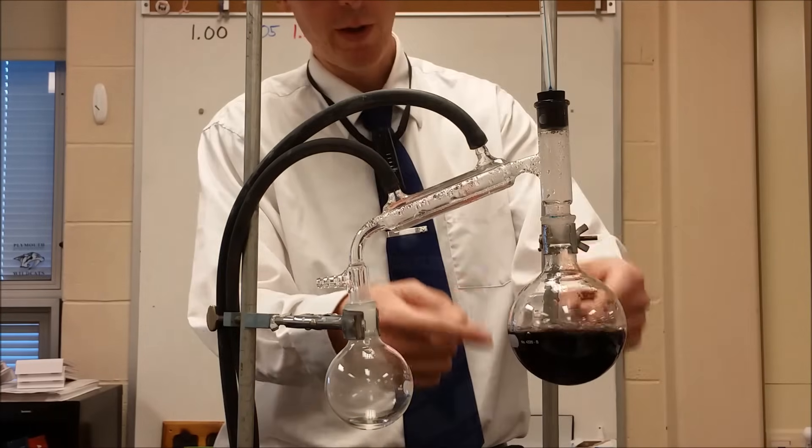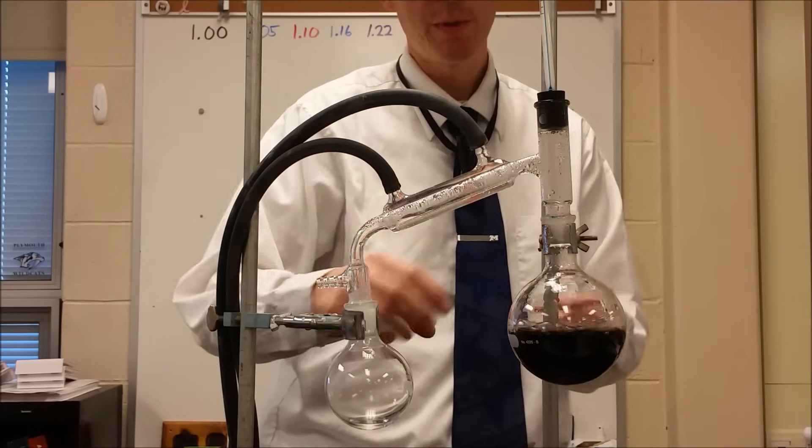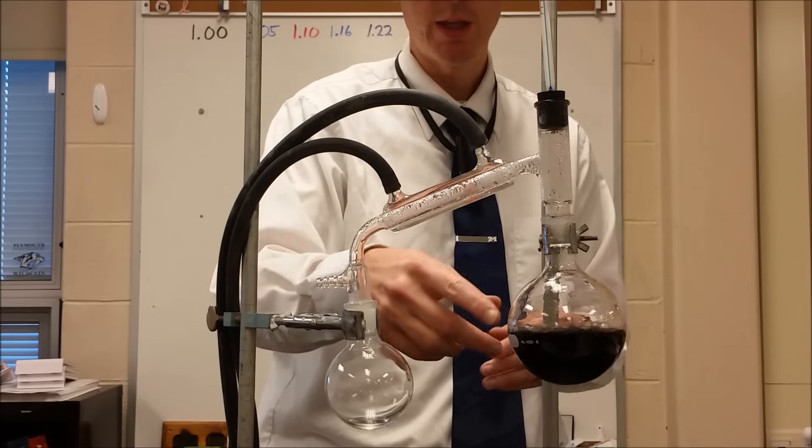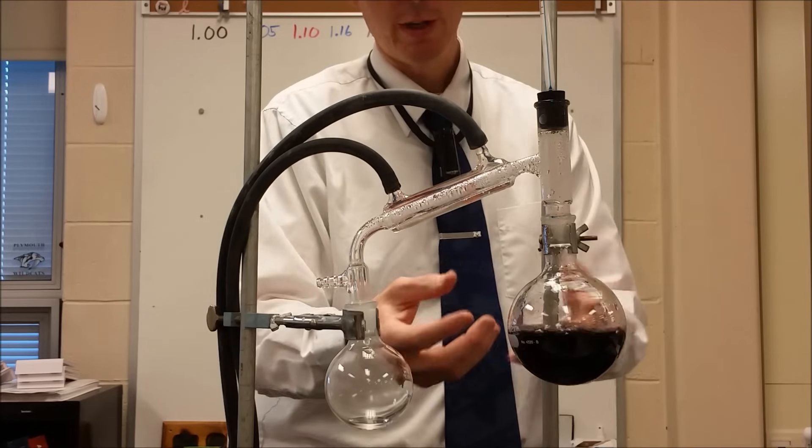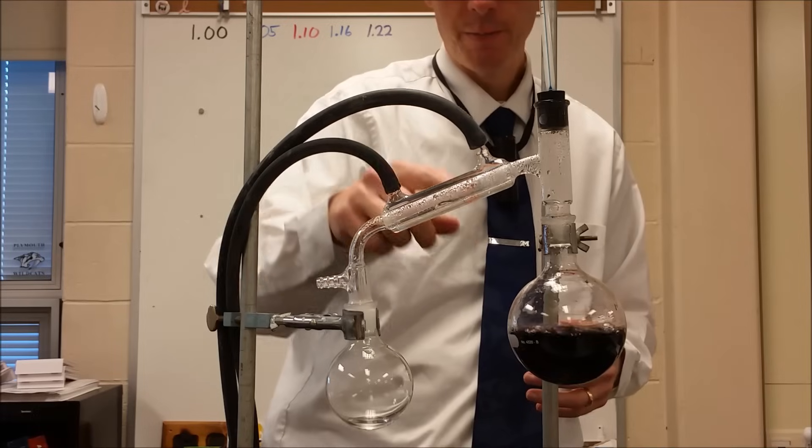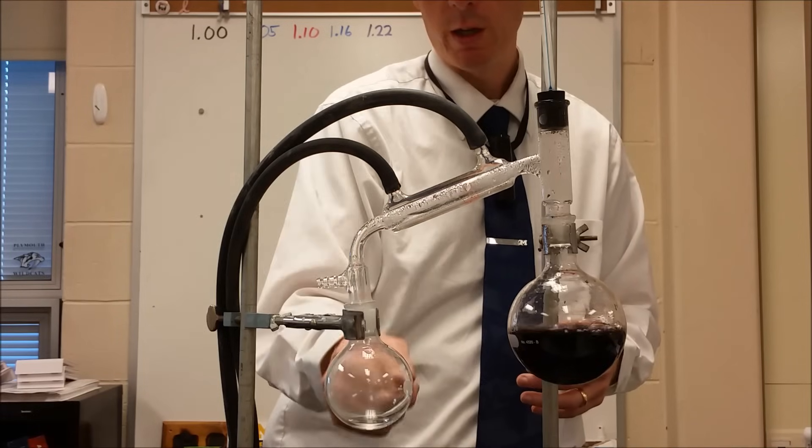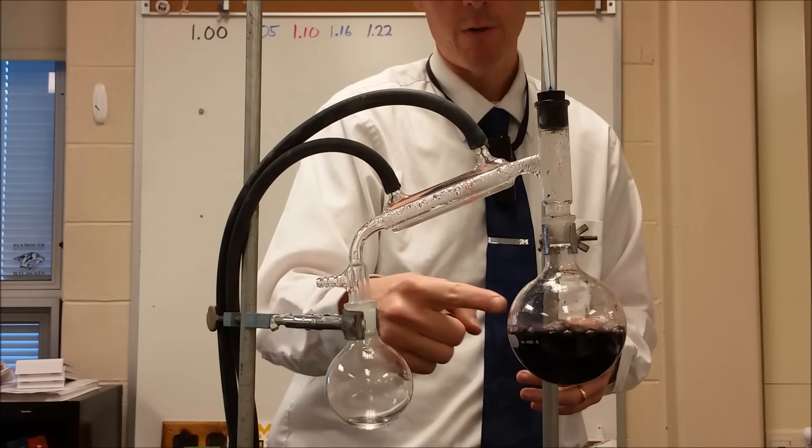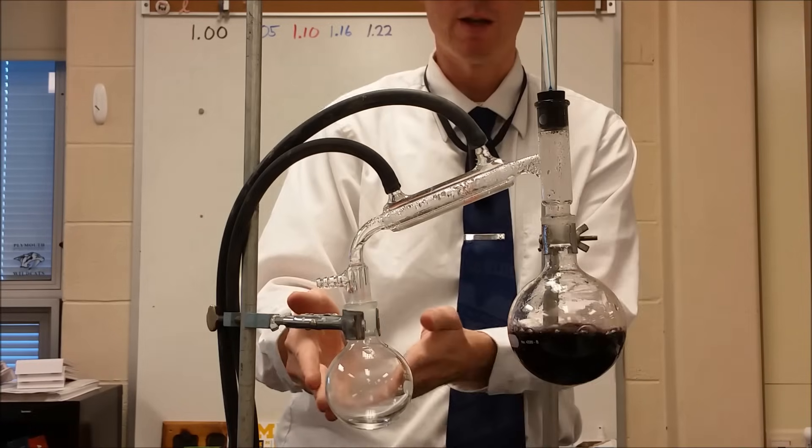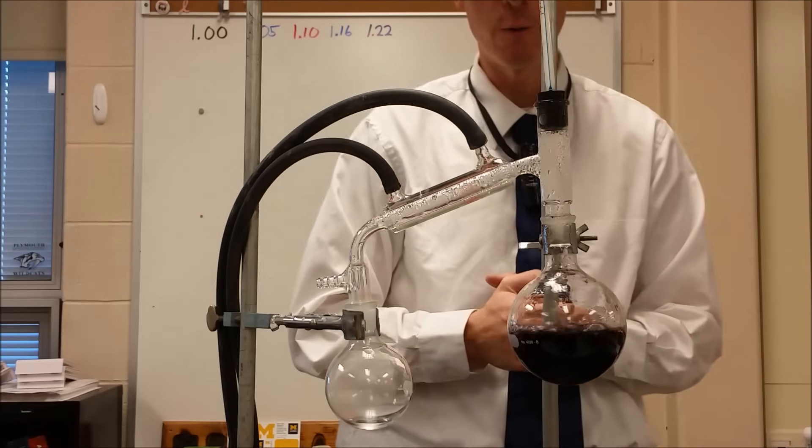So the separation is now going and we have the water coming off of this because water is at a lower boiling point than whatever the substance is that's used for the food coloring here. So we see the water coming over here in a much purer state than we have over here, and we can tell because this is colorless and this still has obviously the food coloring in it.